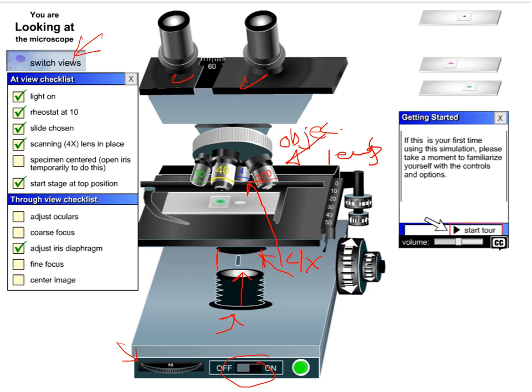The at-view checklist shows items that need to be checked off. When I went through it, I had done five out of six. The last one — moving the specimen — hadn't been done. The onion slide needs to be moved to a certain position, which you do using these two controls. Also, the stage at the top needs to be in position, meaning you adjust the coarse focus to lift the stage up to its maximum height.